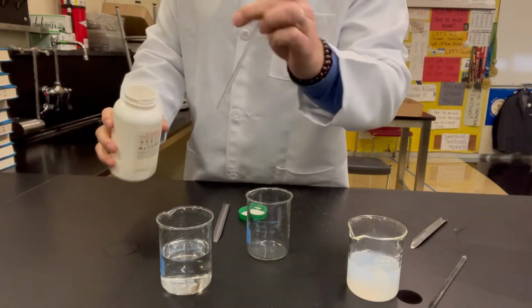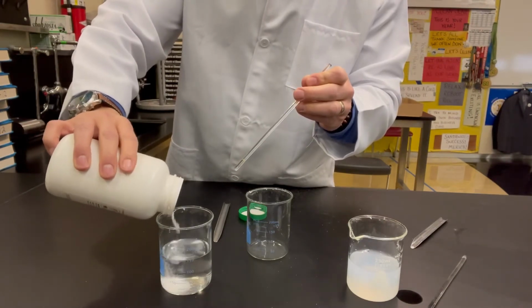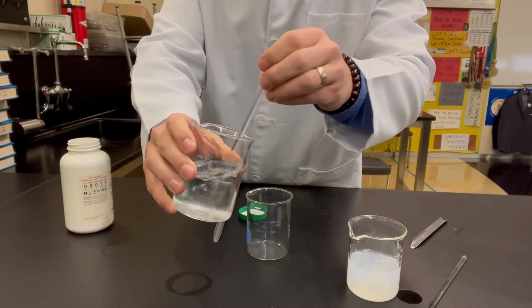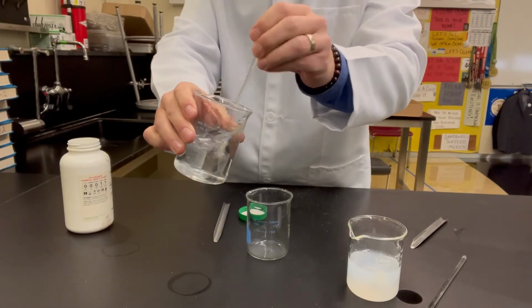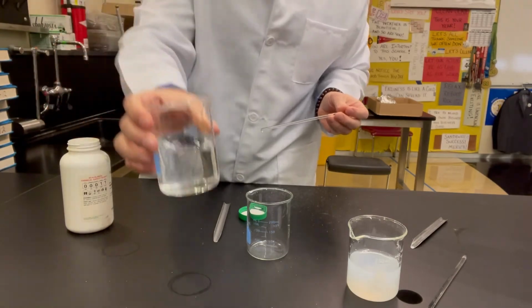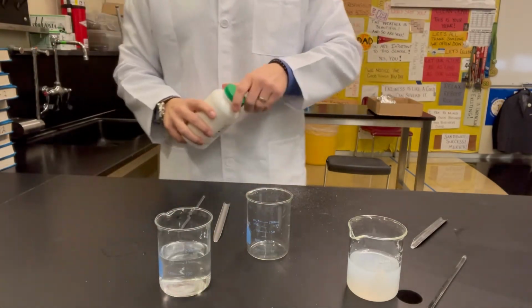So I have some water right here. I'm going to put some of my powder in. And I'm going to stir that up and dissolve that into the water. Now that that's dissolved in the water, I have 2 aqueous solutions of 2 different compounds.